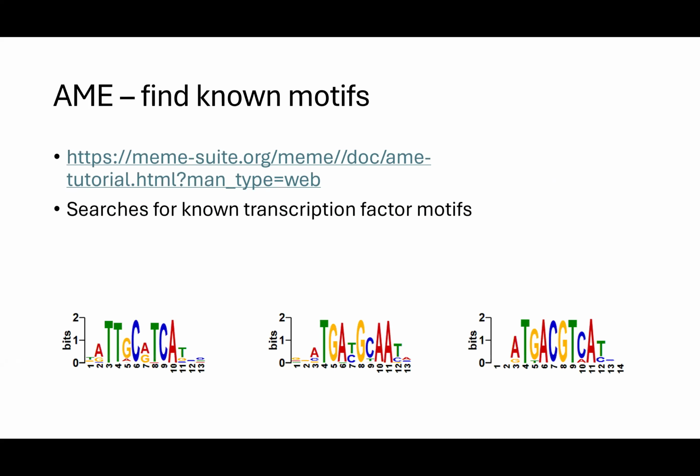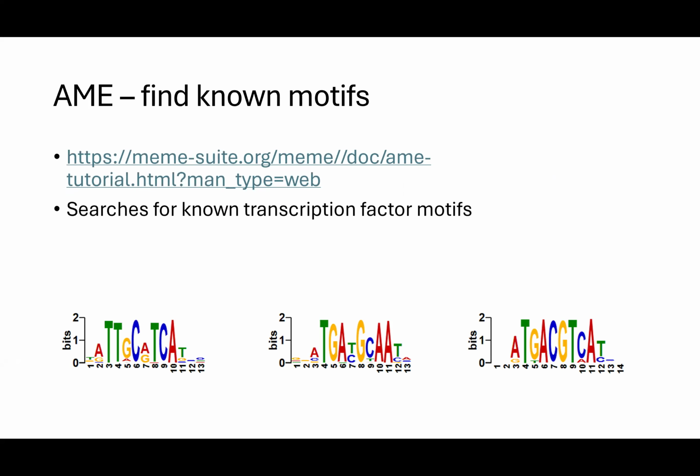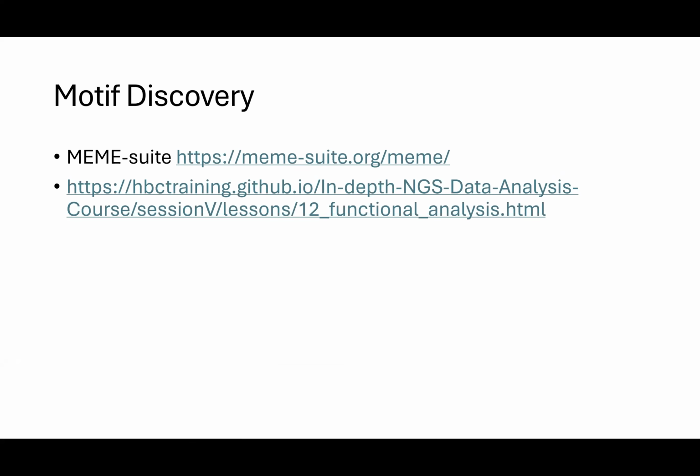A little over, so I will go through this quickly, but the last thing I want to show is motif discovery. This is finding if there's a particular sequence of DNA that's really enriched in one of your target regions. The main tools for this are called the MEME suite.